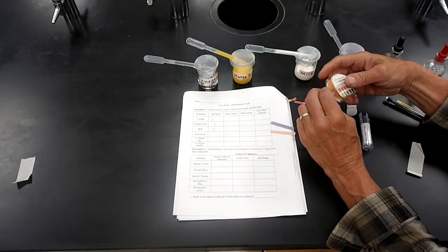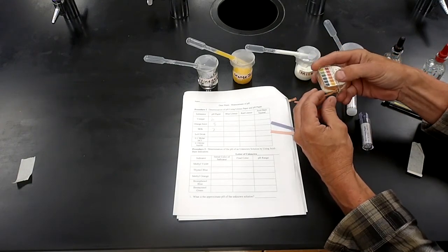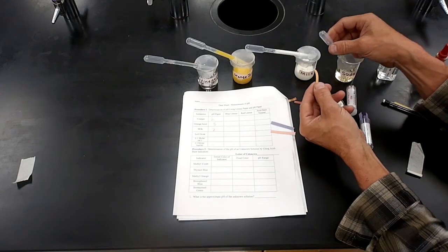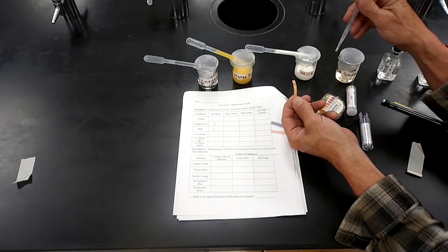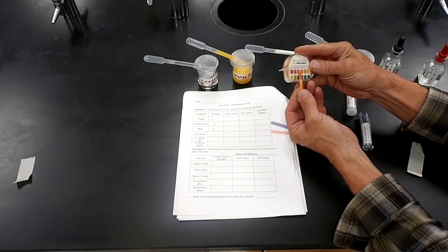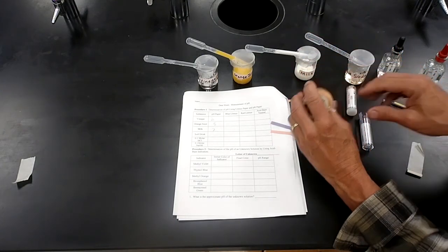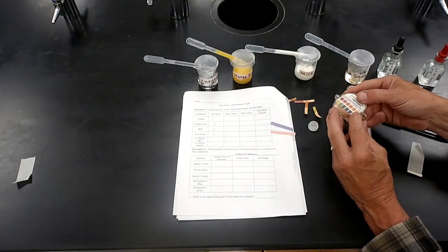Then I'll get another bit of paper. Hit it with the soft drink. I think the ginger ale here, see what we get for that. Oh, a little reddish, orange. I'm going to call out a pH of 3. Put that 3 here.